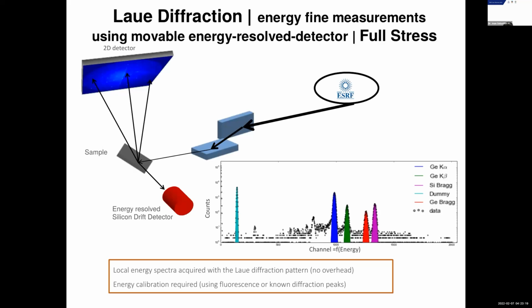First, the intensity of the Laue spots depends on the volume you probe in your sample, the number of electrons, so the electron density, and also the disorder. We can measure the Laue pattern of a diamond, because the diamond is so well crystallized that you can still have a Laue pattern.